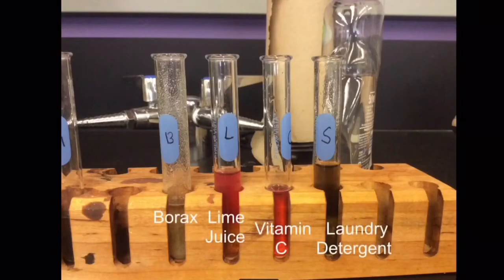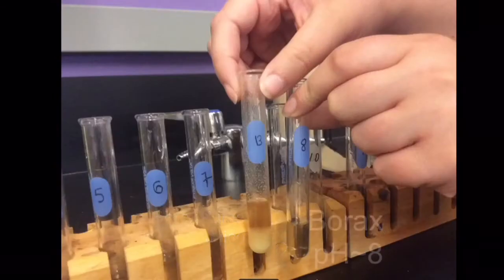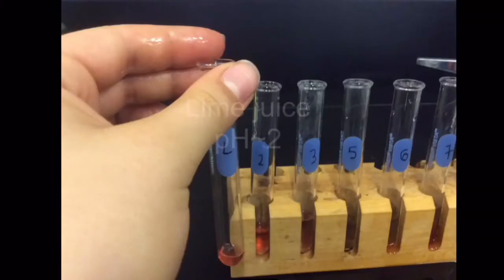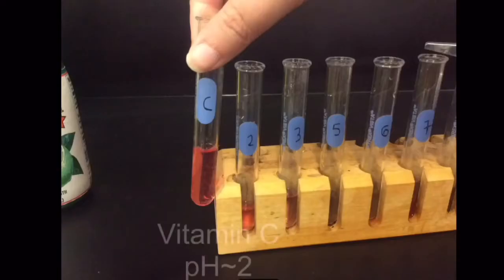Put 10 drops of the cistis indicator into the samples of household items. You find the approximate pH of the substance by comparing it to the colors of the substances of the known pHs.